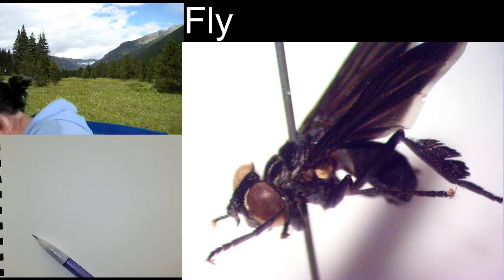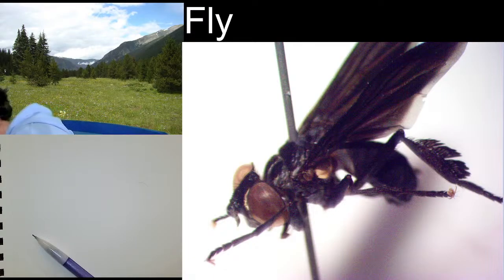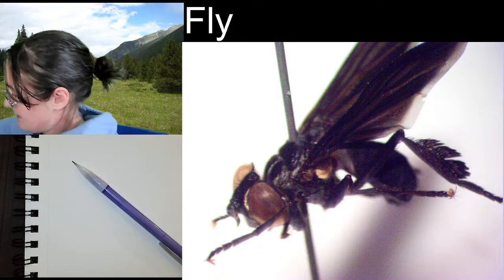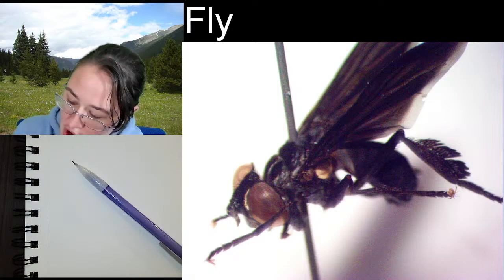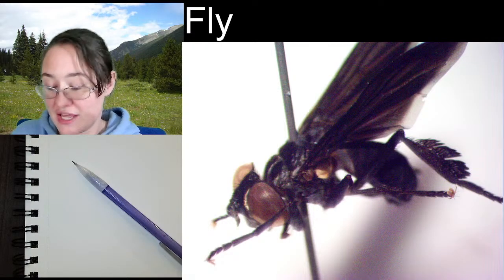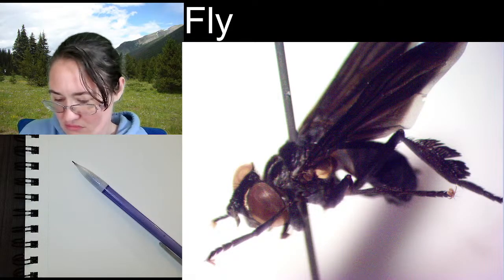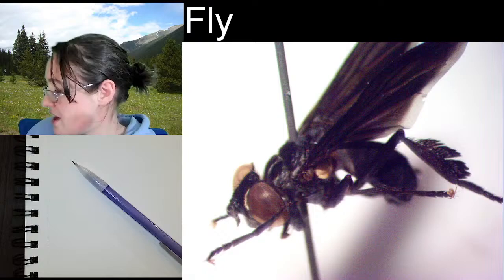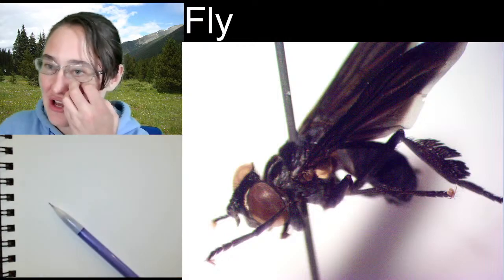I was actually trying to see, because it is so new that it doesn't have its locality label on it just yet. And its location label is sitting right here somewhere. So I thought that if I could... Here it is. Yep, that's it. Okay, so this fly is from Brendan T. Byrne State Forest Campground in New Jersey. It was collected in July of 2022. It just doesn't have a label just yet. So that's fine, though. So it was found in Brendan State Park.